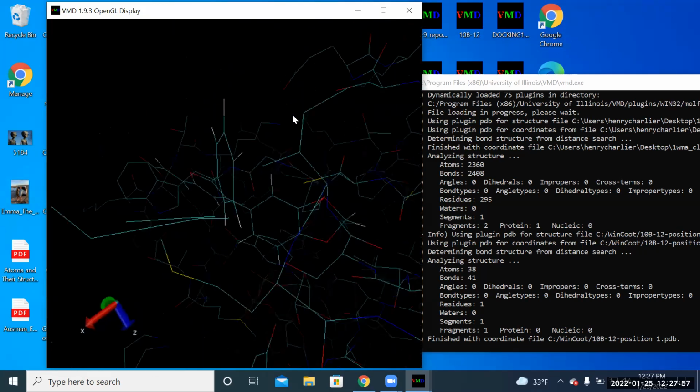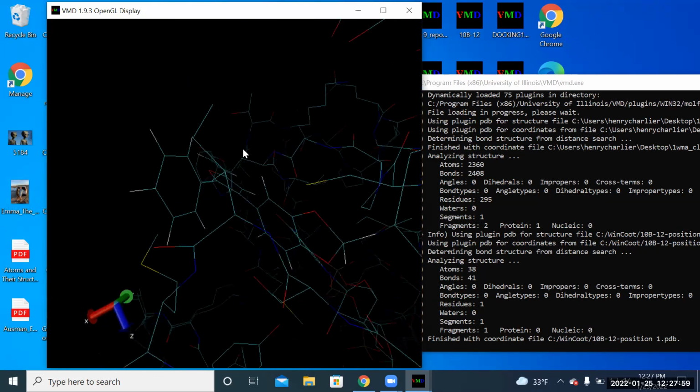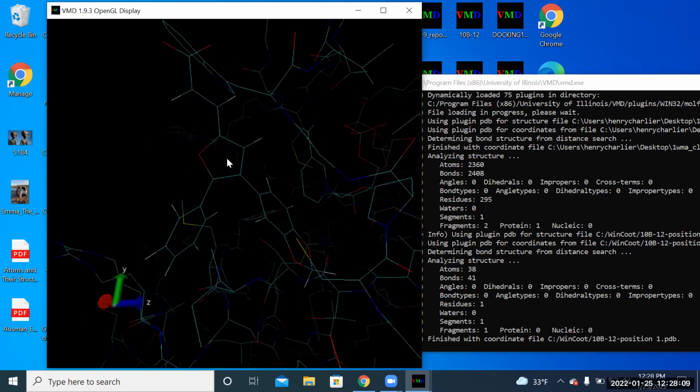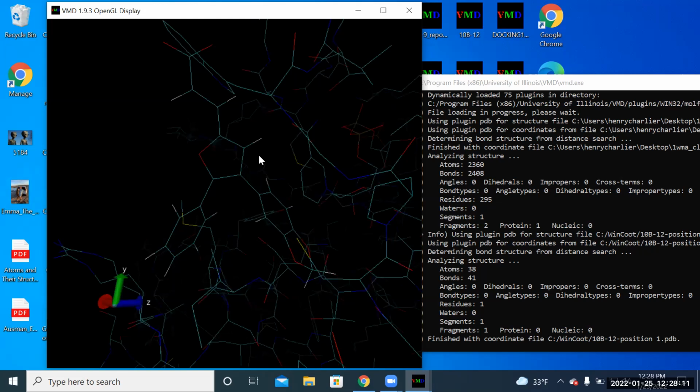And that's where I try to make it so that if something can hydrogen bond, in other words, it has the right kind of hydrogen and the right kind of hydrogen acceptor, in other words fluorine, oxygen, nitrogen, then you would expect a range of distance between, at the very closest, maybe 2.6 angstroms, which is pretty close, and out to about 3.1 angstroms.